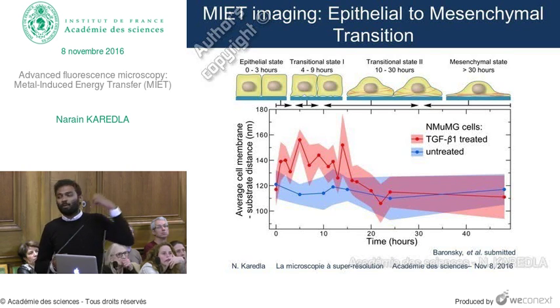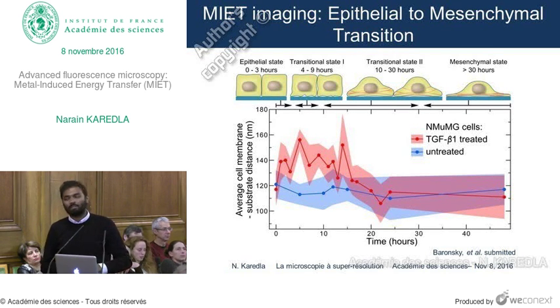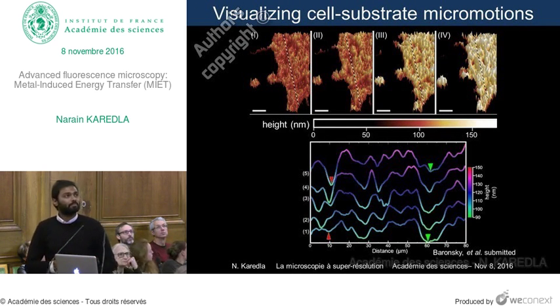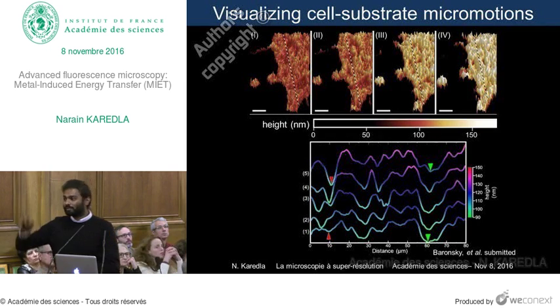So it was known before. They had theoretical models of this, but it's the first time we are seeing such a proof, such an experimental evidence. It is nice to see that. So during the first stages, you have a lot of activity in the cell membrane. Here are the four time lapses which show the average height of the cell increases, and apart from that, you see a lot of structures which are dynamic and change a lot during the time.